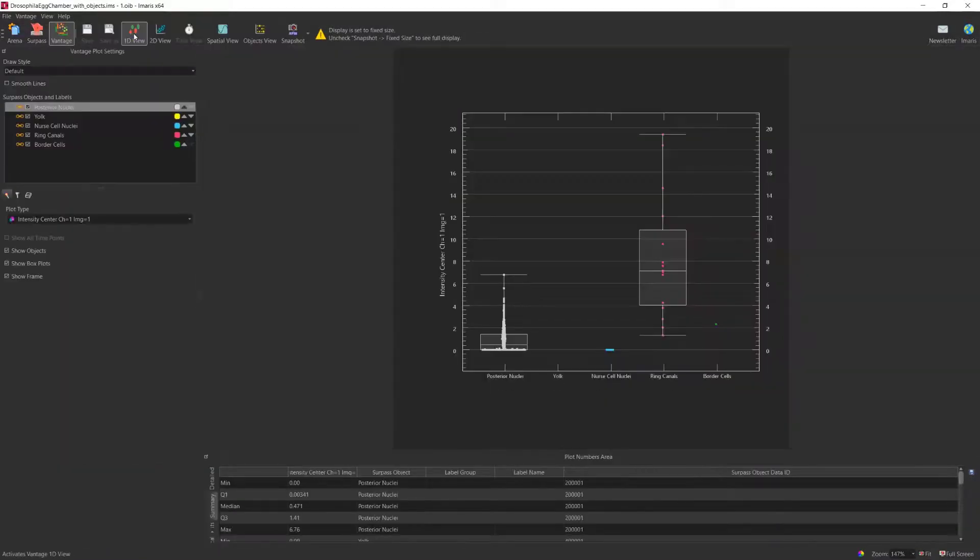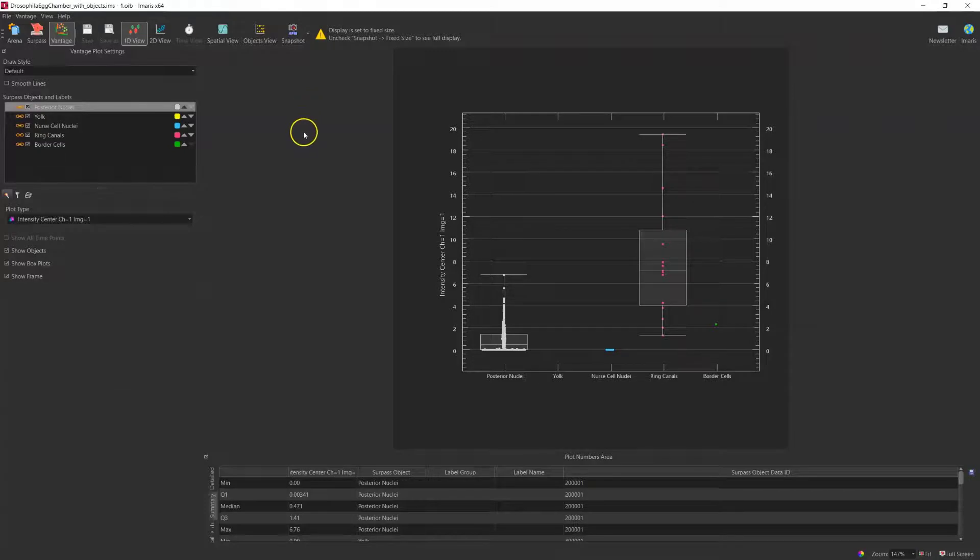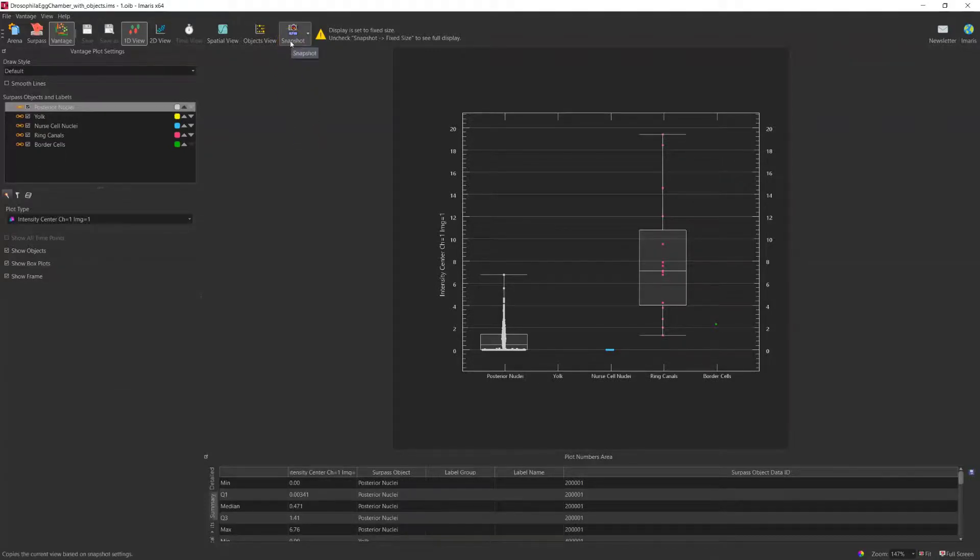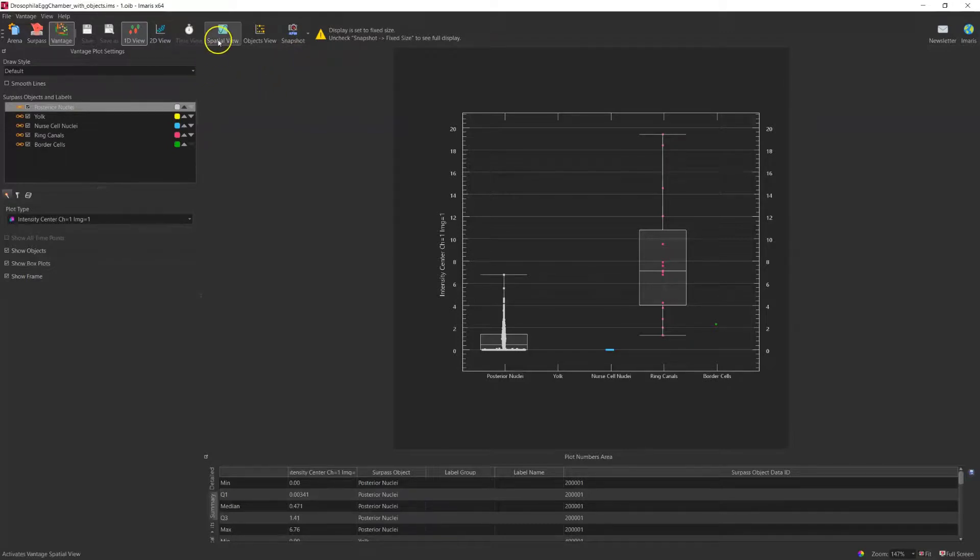Under 1D view and 2D view, the snapshot function works the same as previous examples. If you want to save the figure from time view or spatial view.